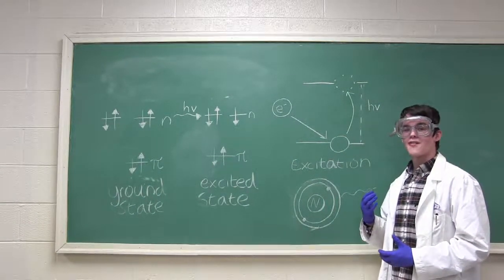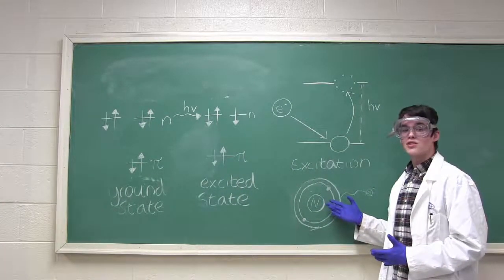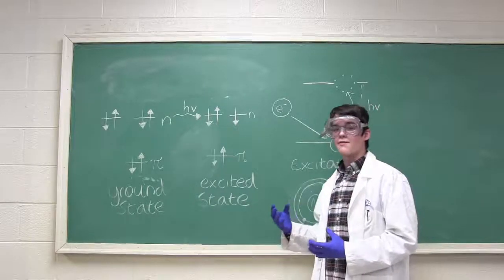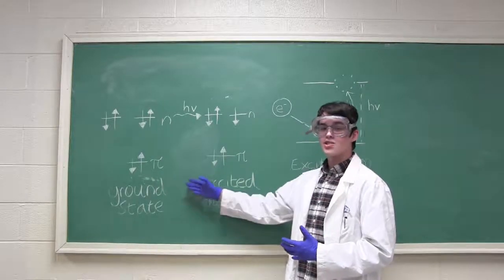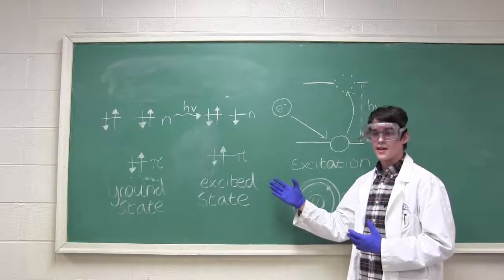These solutions have metal ions, which have their nucleus made of protons and neutrons, and the surrounding electron cloud. In this electron cloud, we have the electrons. The flame from the Bunsen burner adds energy, taking the electrons from the ground state, a very low energy stable state, into the excited state, a very high energy but very unstable state.